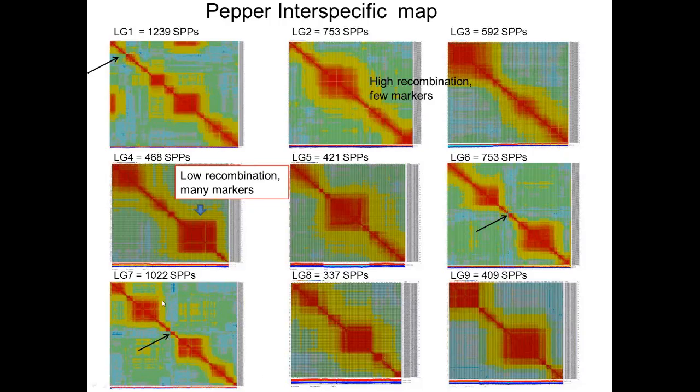There's a couple other highlights. You see over here there's this yellow, versus everything around here is red, except there's a marker here that is yellow. So it kind of belongs here, but for some reason it's not as tightly linked as the other markers. So we can go to this marker and look at the data again and ask, is this data good? Where does this marker really fit in here?